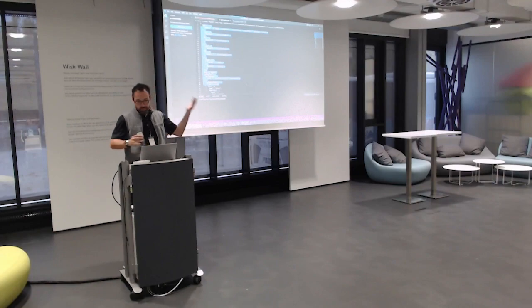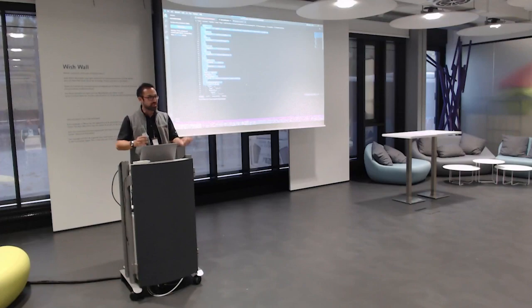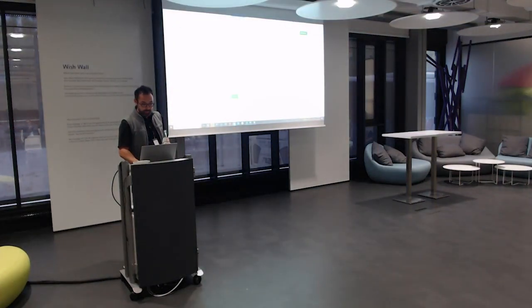This says JSON. If you ask nicely, an IT person can probably transform that Excel for you into a JSON. Otherwise, ask ChatGPT to transform a given TXT file into a JSON format. ChatGPT is actually very good at that. And then you upload that into Signals Notebook, and off you go. You will get a new library imported and accessible for your users to use in their experiments.